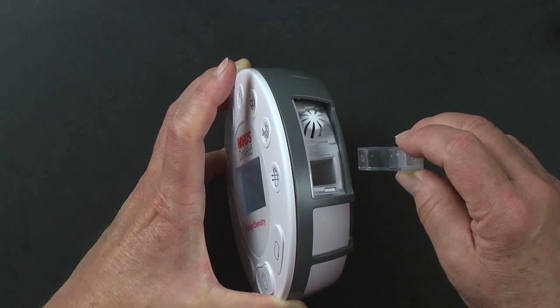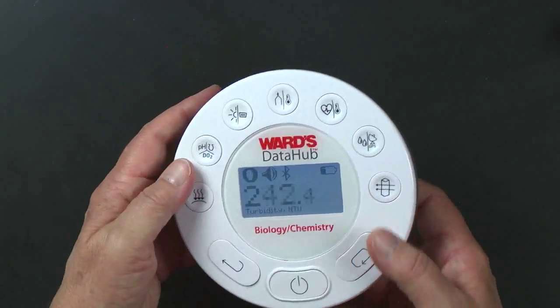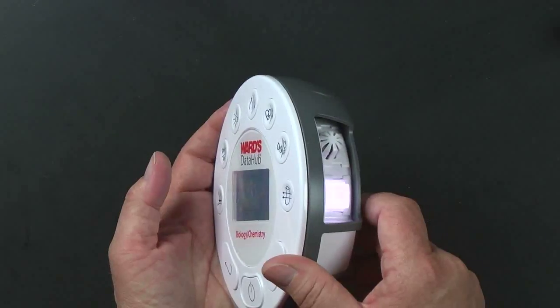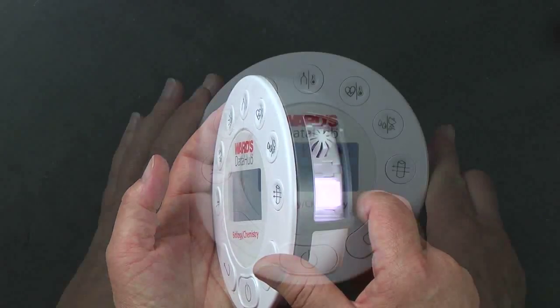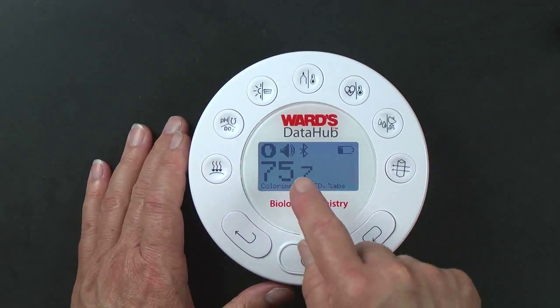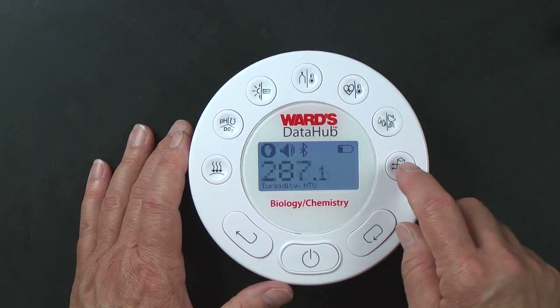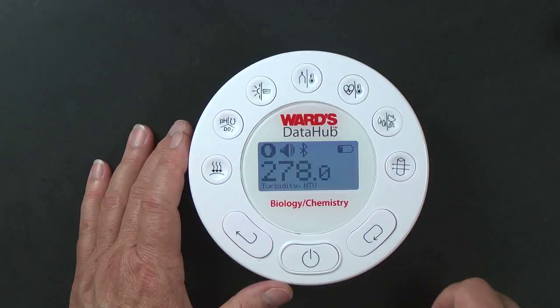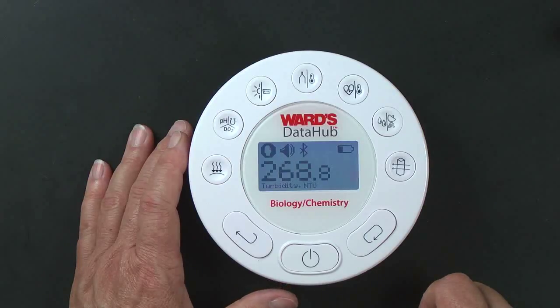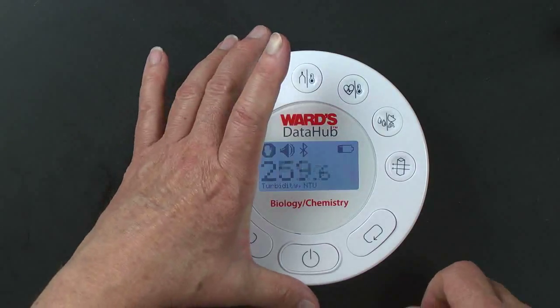liquids. So once it's capped and you put it into there, you can click that and you can actually see there's a light. And so you can test turbidity, or you can test, in this case, it's the red, green, blue wavelengths, and then what is the absorbance, so how turbid is it? And you know that the absorbance is inverse of the transmittance, so this number will change.